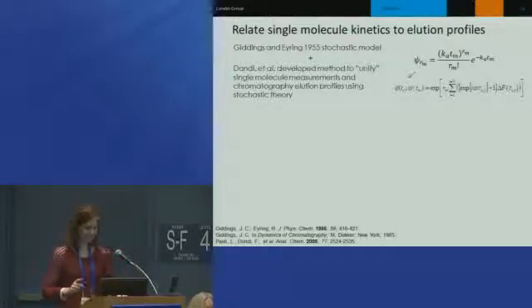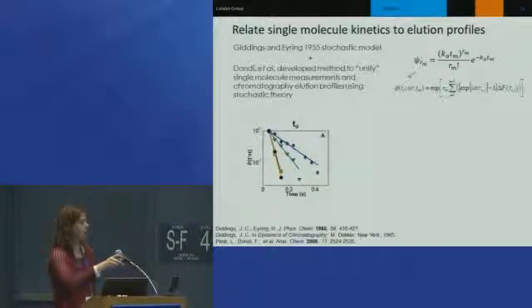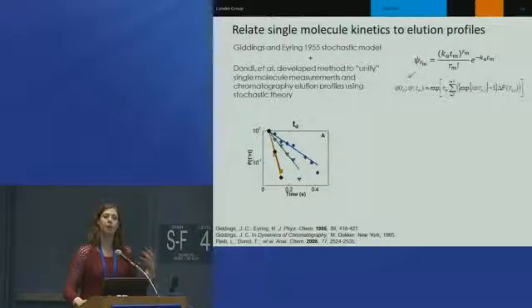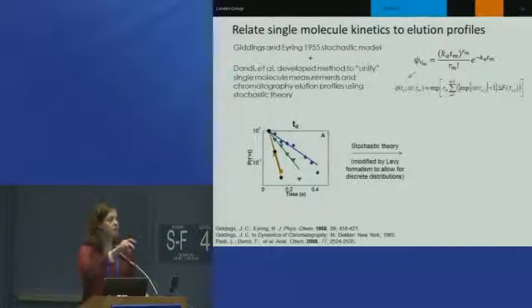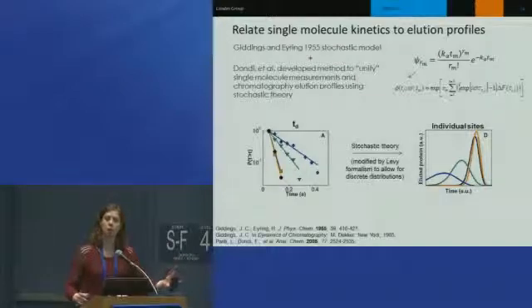Okay, awesome. So one of the things we were really excited to learn is that now that we have extracted all the rate constants and time constants for these different types of supports with all the different ligands, we could relate our experimental data to the theory by Giddings and Eyring, which really means, from a practical respect, that at any one of these little adsorption centers, if you created a column with that perfect interaction, just magnified it over the course of the column, you could say, via this theory and our experimental data, that each one of these is the elution profile that would result from a continuum of these types of interactions occurring through a column.